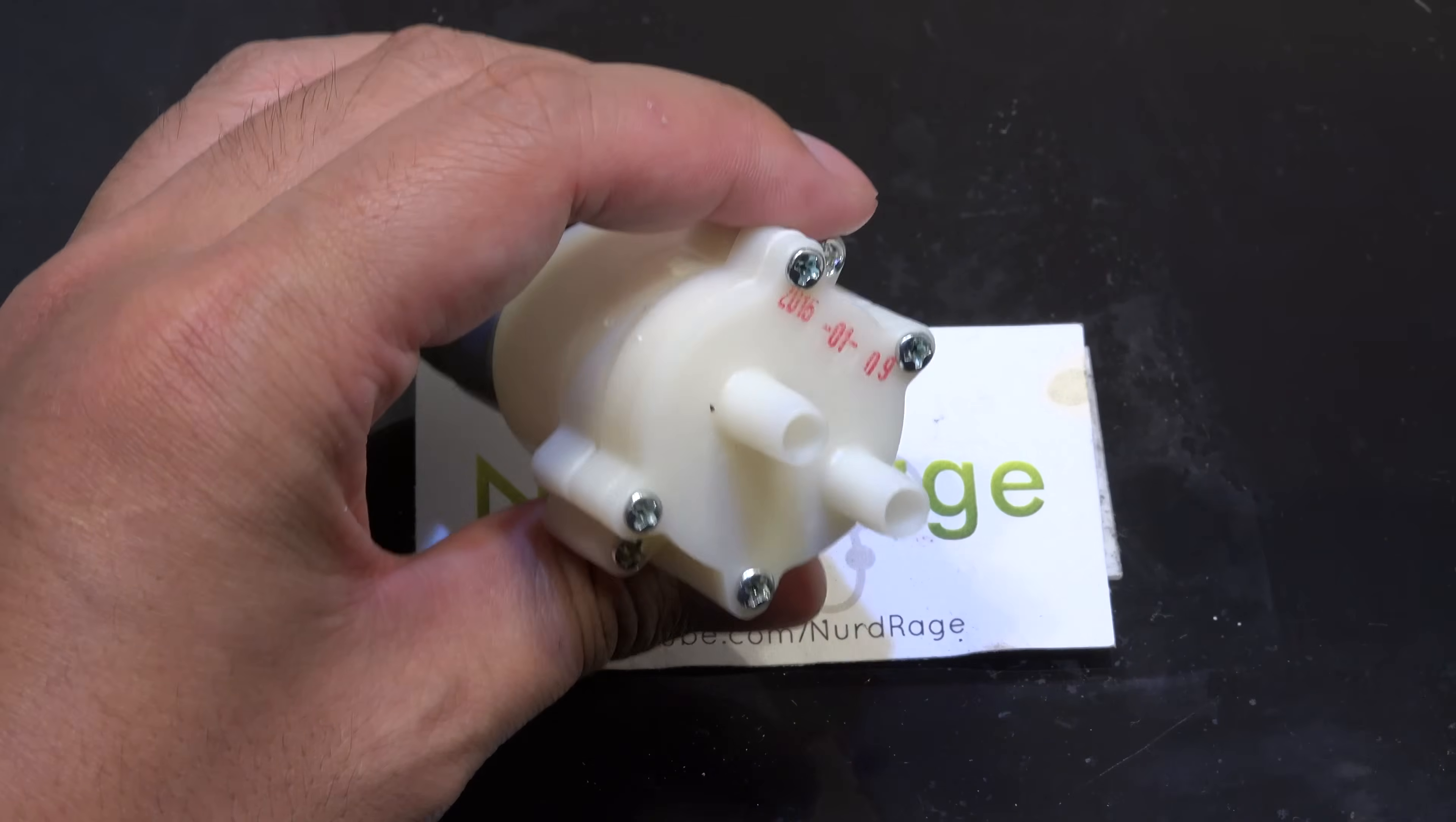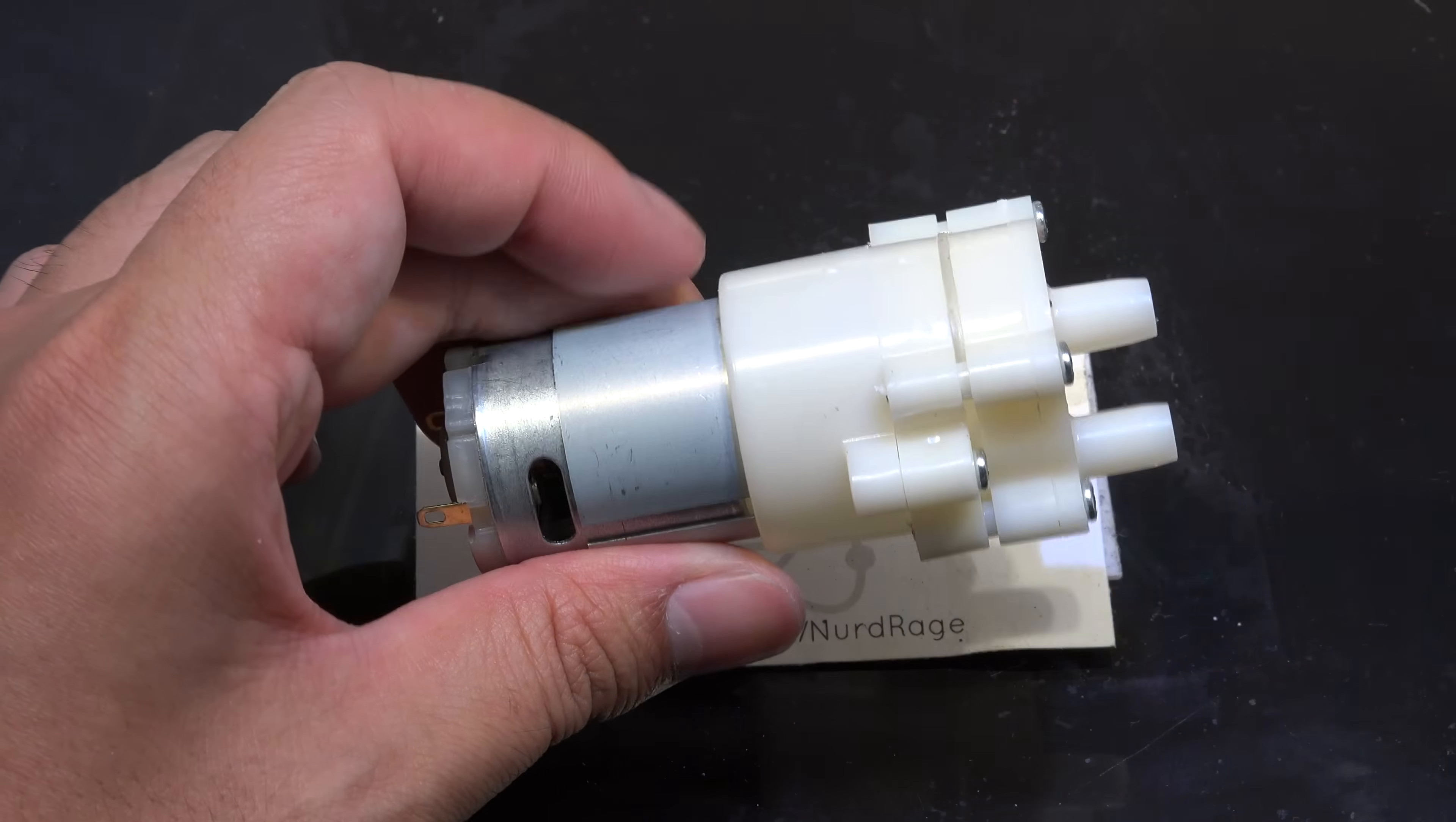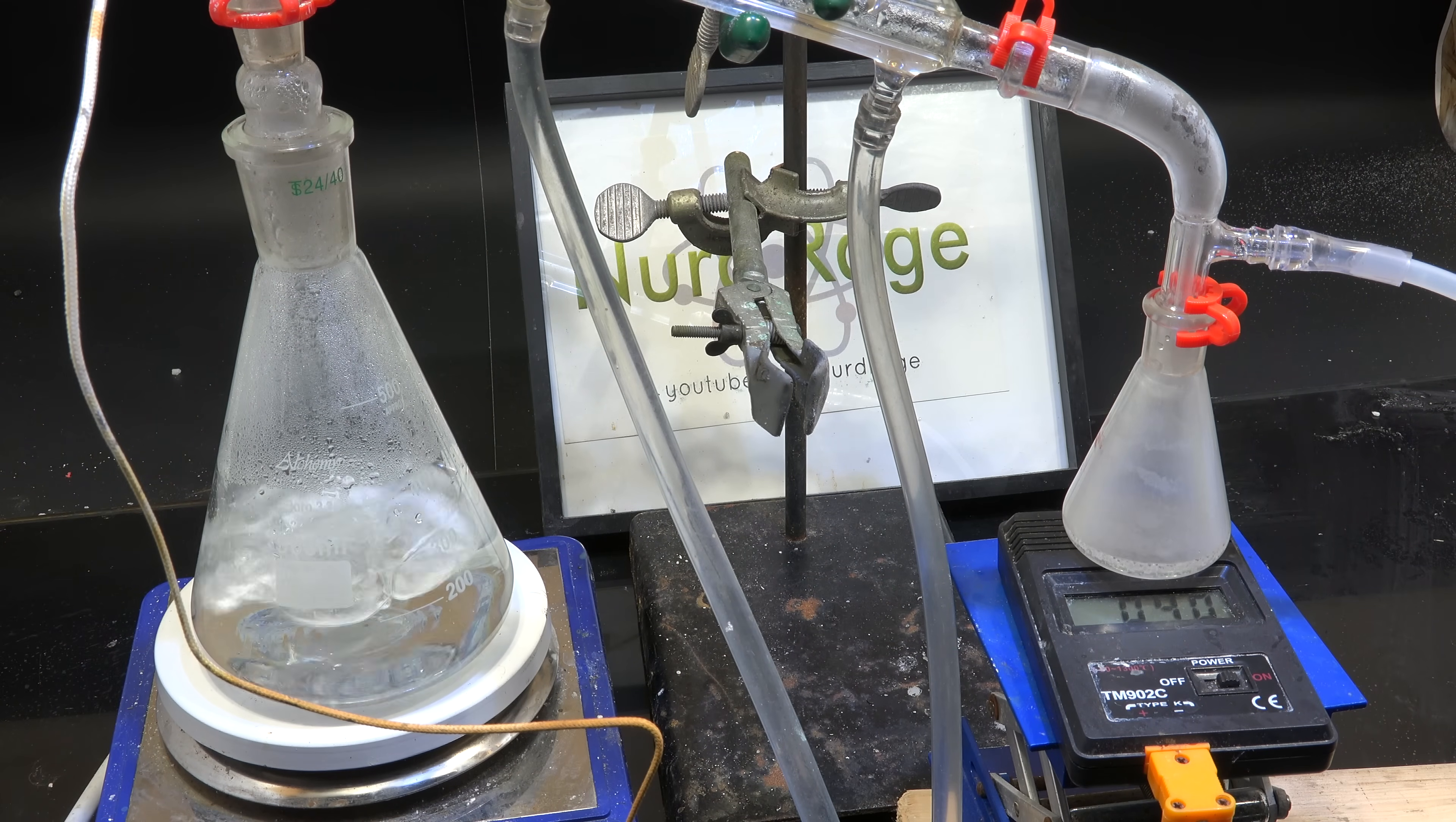Greetings fellow nerds. A vacuum pump is an optional but extremely useful thing to have in a chemistry lab. You can use it for vacuum filtration, drying chemicals, and for changing the boiling points of solvents in distillations.